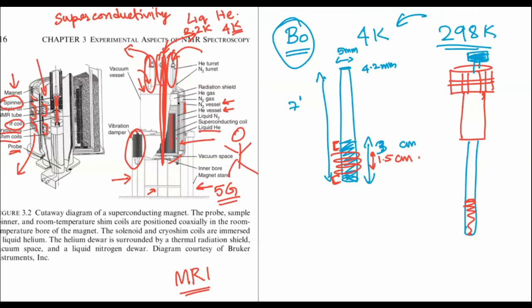And the magnet, once again, which we saw in a little bit of detail here, is shown here. How does the magnet look? So far, what we have seen is the block diagram of the NMR spectrometer and how the magnet looks. The magnet has different cryogens in order to ensure that the superconductivity is maintained at a low temperature. And the nitrogen is something which we fill every week. On the other hand, helium is something which we fill every three months or so.